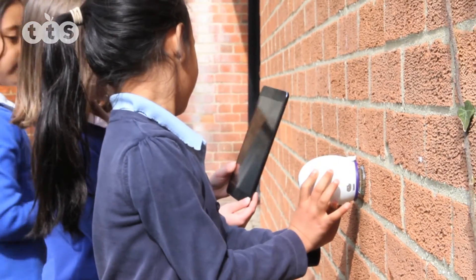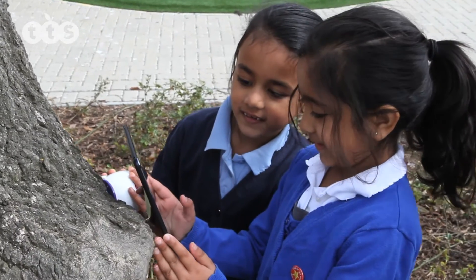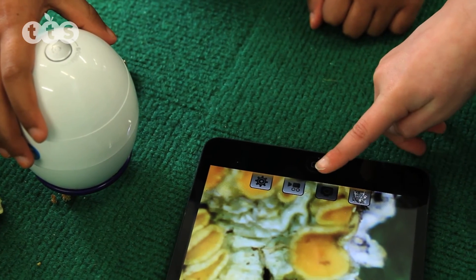It gives the same performance as the EasyScope, but uses wireless technology, so there is no trailing lead and can send images to a computer up to 10 metres away.